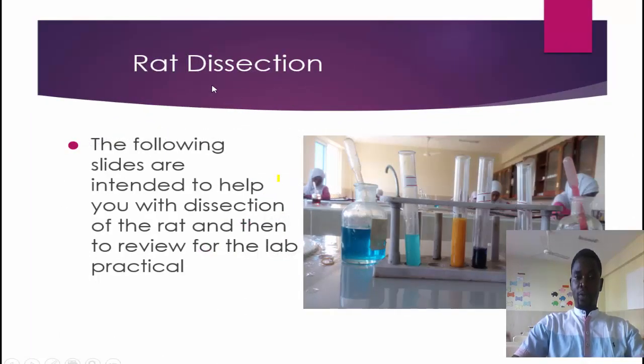Rat dissection. Today we are going to focus mostly on the rat dissection. The following slides are intended to help you with dissections of the rat and to review for the lab practicals. Okay?